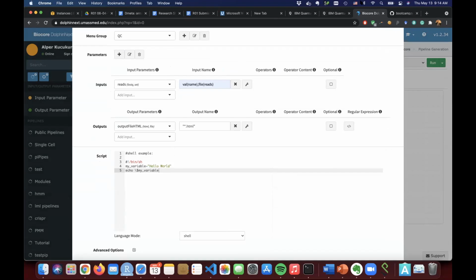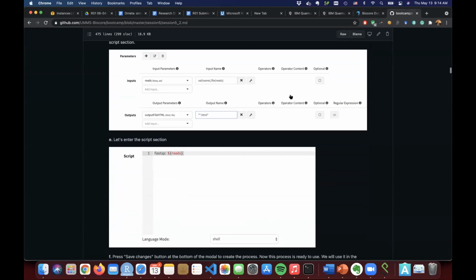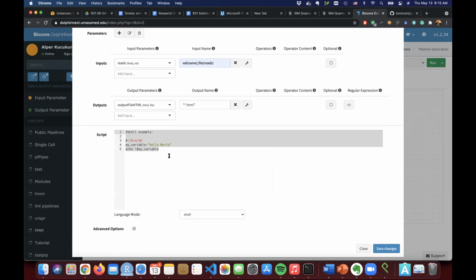Okay, good. I'm just going over this real fast to show you what we are doing. So now we are ready, we get the inputs. We just simplified all Nextflow workflows like this: you have your inputs, your outputs, and your scripts. When you think like this, you can create more modularized pipelines by putting very small commands into these sections, and you can use the same thing in other pipelines.